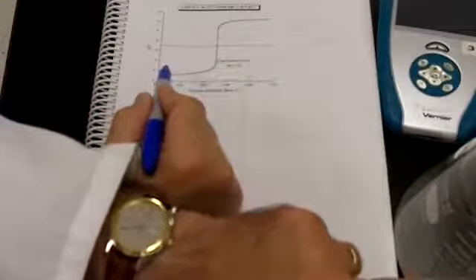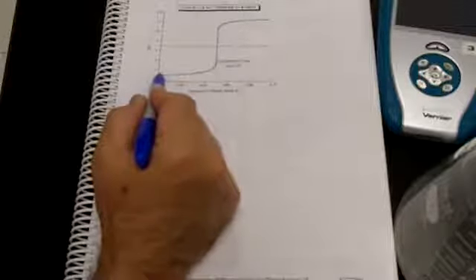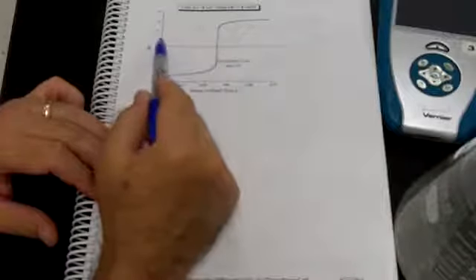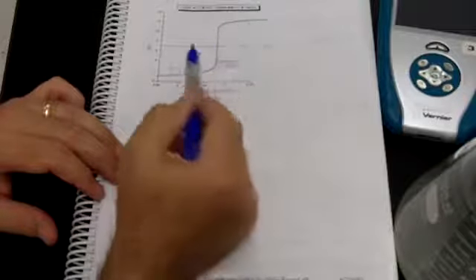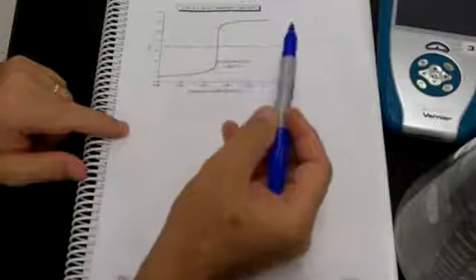We know that because in the flask we would have a low pH because that's an acid, and then slowly the pH would rise, and then at the equivalence point, the pH would be 7, and in fact it is 7. It's right between 6 and 8, so it is 7. So this appears to be a graph of a strong acid being titrated with a strong base. These are exactly the features that we would see.